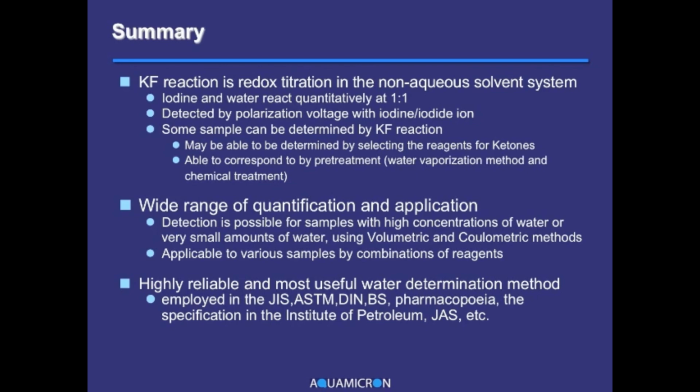Third, the Karl-Fischer water measurement method is highly reliable and can be the standard water measurement. There are other methods to measure the water or moisture content, such as measuring loss on drying, using near-infrared absorption spectroscopy, employing gas chromatography, and so on. Let me suggest that the Karl-Fischer titration is the most useful method due to its wide-ranging applicability and that it has become a standard for water measurement due to its accuracy and reliability.